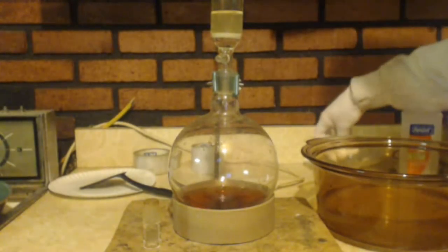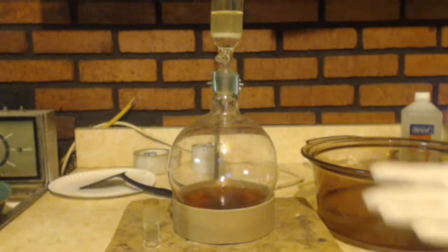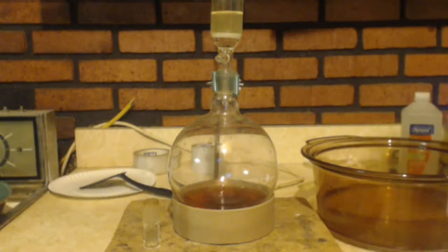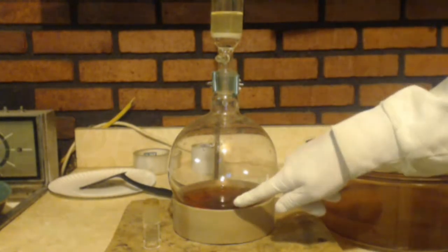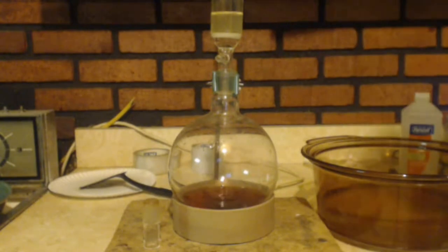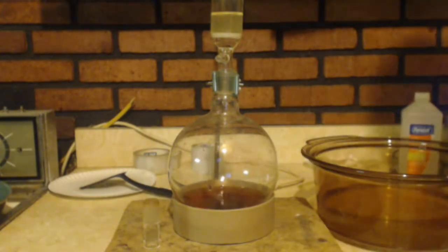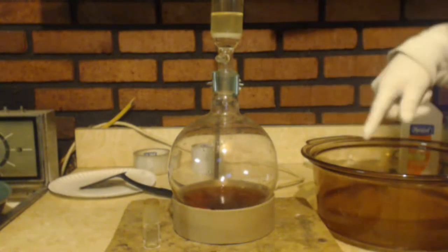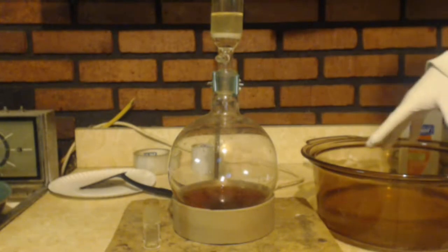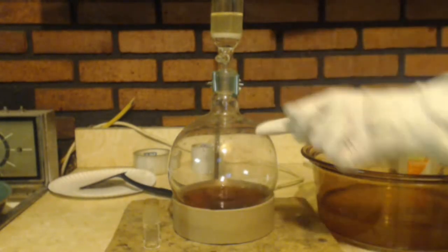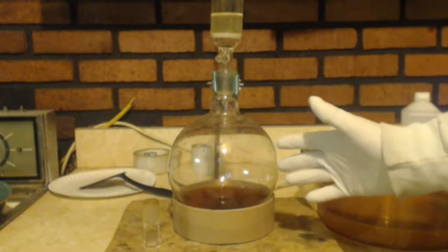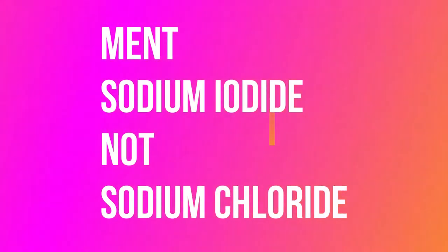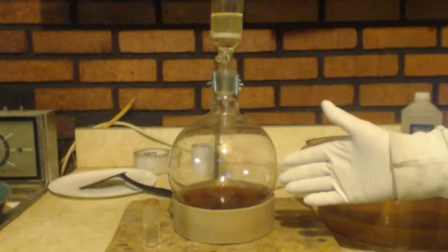I'm adding sodium hydroxide to the iodine water solution, so just like when you add chlorine to sodium hydroxide and make sodium hypochlorite, here I'm doing the same thing — except I'm adding it in reverse. The iodine is mixing with the sodium hydroxide solution and you're making your sodium hypoiodite. There's your salt — I'm not going to try to purify or extract it. Keep in mind you're also making sodium iodide and water.